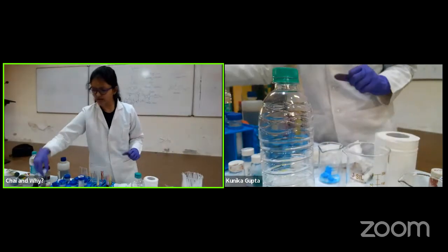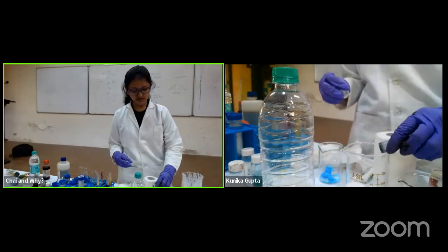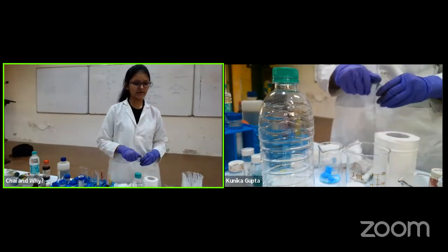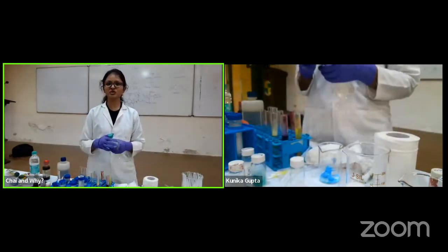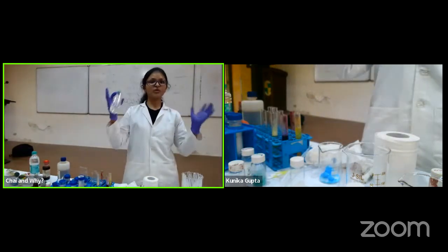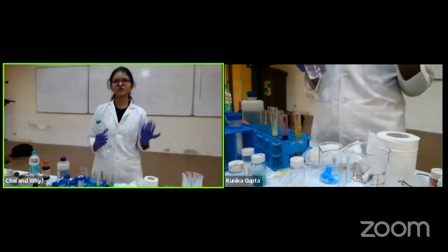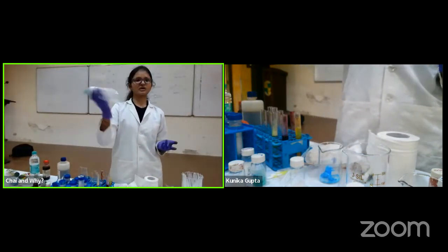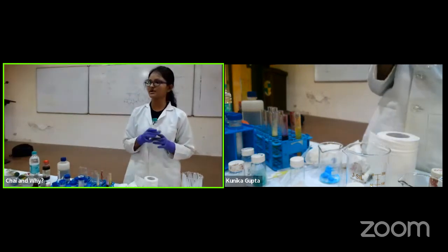Methylene blue is actually a redox indicator. So it will show the redox chemistry which can happen inside this bottle. Glucon-D is a reducing sugar, I told you, it will reduce. But you know that the atmosphere has a lot of oxygen. Whatever things get reduced will again be oxidized. Right now I can't see anything in it, so I have to have an indicator so that I can see the process which is happening in the bottle.